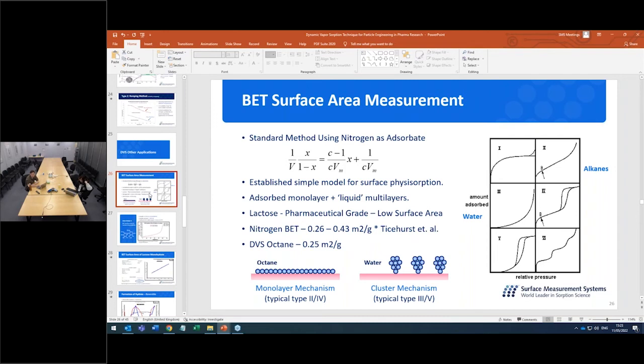I would say generally that the sensitivity is 0.5% or below 0.5%, depending on the method and depending on the vapor used. Other questions on amorphous phases?